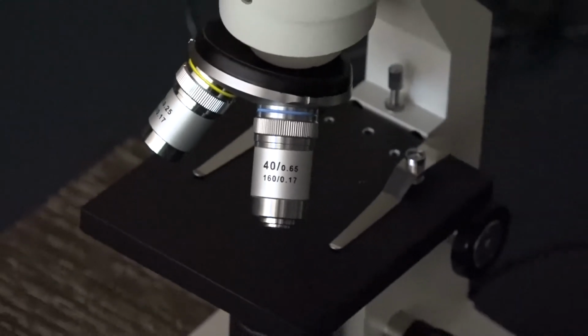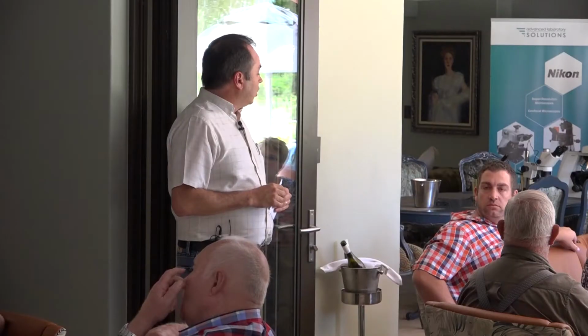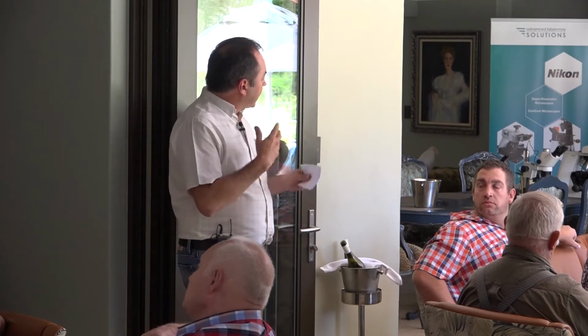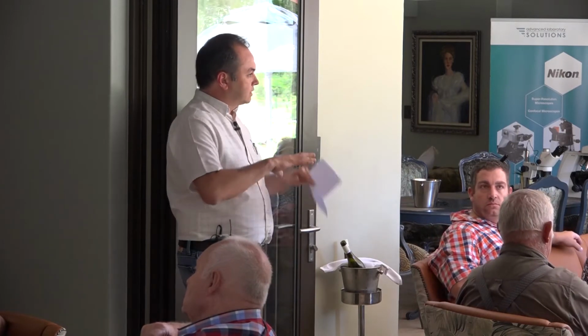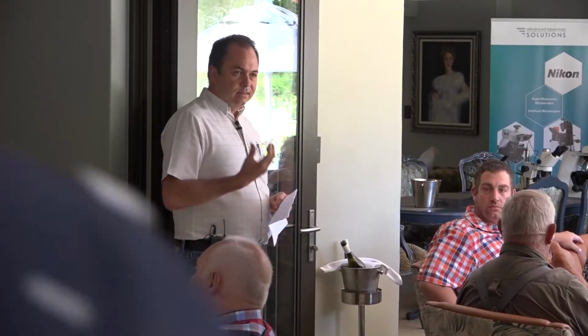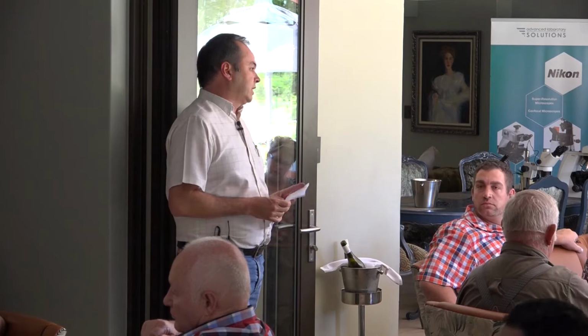The classic compound microscope, everything that you see is flat. You don't get that 3rd dimension. You don't see height. There are optical techniques, we're not going to get into it, where you can enhance that, but effectively, one looks at a flat sample, and one looks at a sample 3-dimensionally. The other thing I must add is that the stereoscopic microscope has a limit to the magnification. You can't really go beyond 50 times magnification, whereas the other one can go up to 1,000 times. So that just gives you a little bit of an idea.